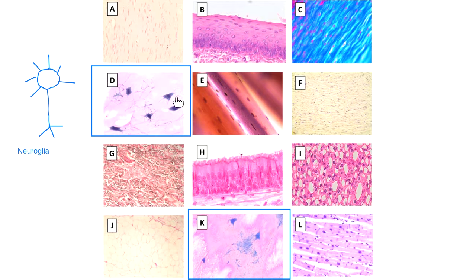Those are called neuroglia. If I go down to my other nervous tissue picture, you can see the neuroglia a lot better. See this blue mass that's inside of here? We've got a few really big dark blue neurons. That's the name of the nervous tissue cells that do thinking. And then I've got a whole lot of these light blue neuroglia that are much smaller. They help to keep the neurons alive.